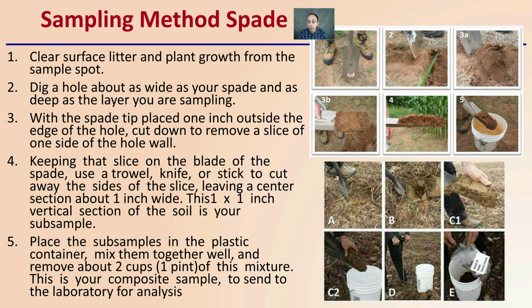That soil should be placed into a labeled bag, double bag the sample, include your paperwork, and send it off to the lab. And as I mentioned before, do not forget the paperwork, for your own sake as well as for the sanity of the lab workers. Be sure to clearly label everything, and double check that you've included the necessary paperwork with your sample. Don't fill it out and then bag everything up and forget to send it off. Make sure you have that paperwork included with your sample and any payment that might be required.